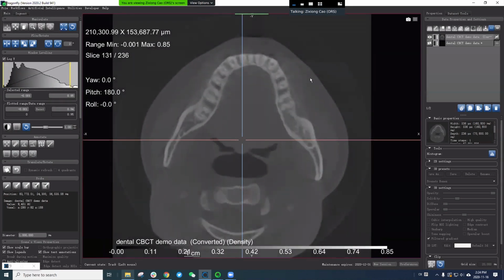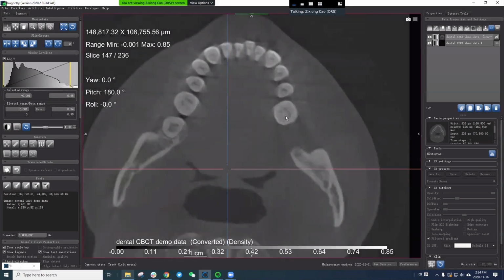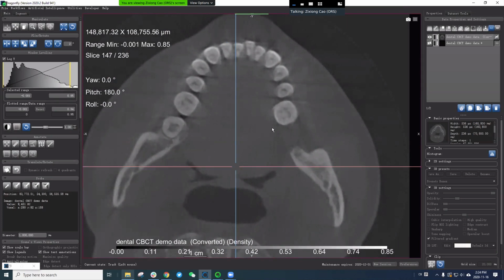And this is a critical step for my data set. As I said, it might not be necessary for your data set, but it's always good to check first. So can we go back to Jeffrey's computer? Sure. I'm stopping my sharing.